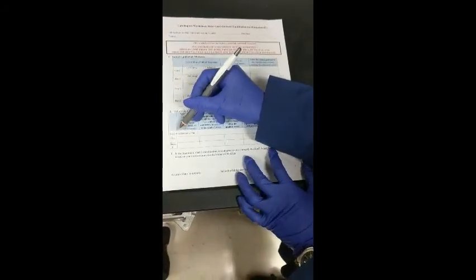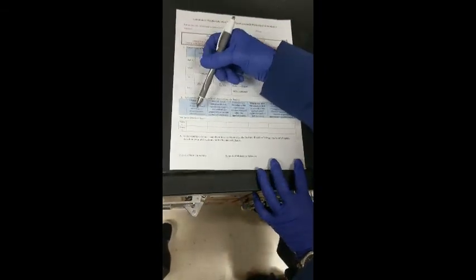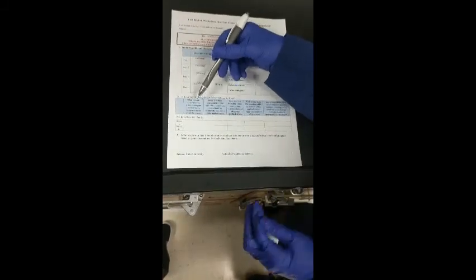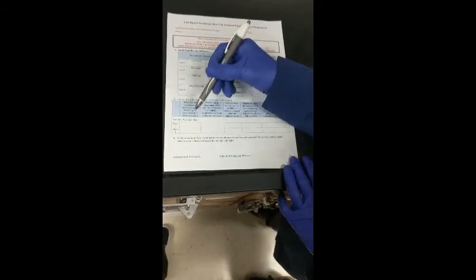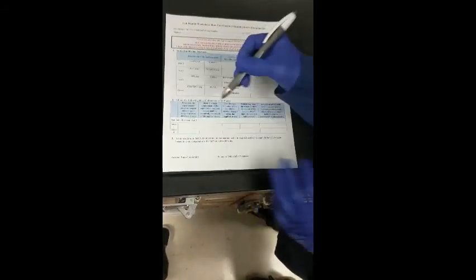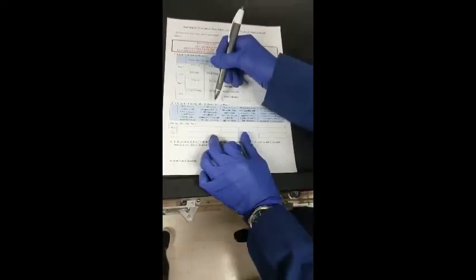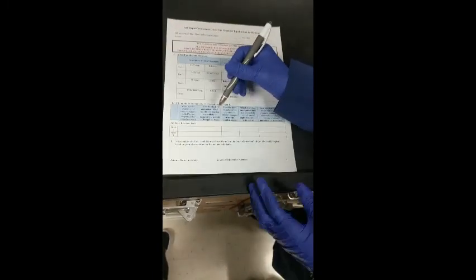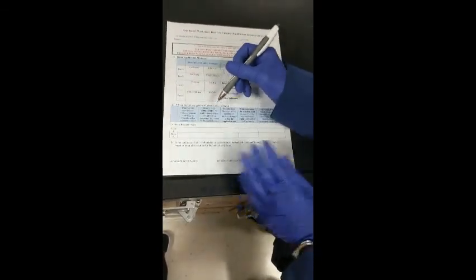In the second table, you're going to first describe the net ionic reaction for each reaction. And then in the first column, you're going to indicate what kind of experimental step you took. For example, when you heated up the solution, please describe that you put the solution in a water bath, or hot water bath, or cold water bath. And then please identify what kind of chemical component is involved in the procedure. For example, in this case, heat is added or removed.